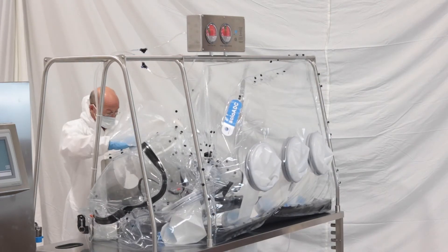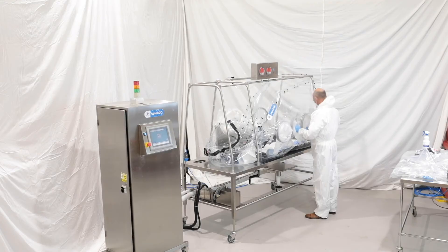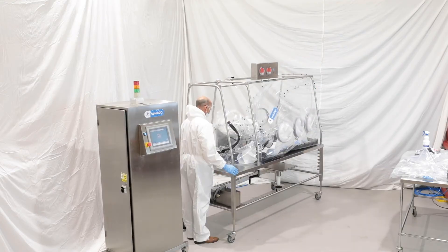The continuous liner port is then uncoupled from the stainless steel frame and collapsed into the enclosure. Note that this is also bonded within the film.